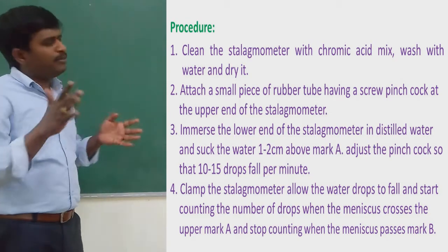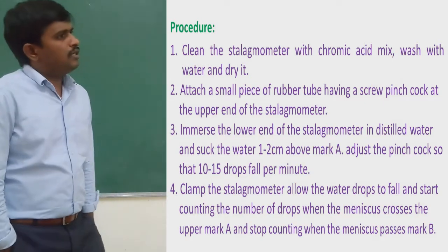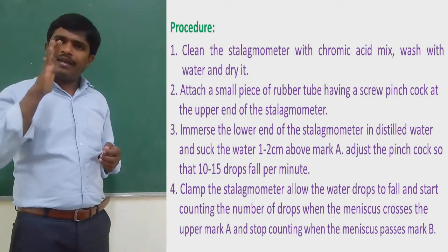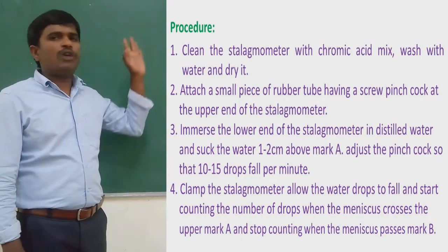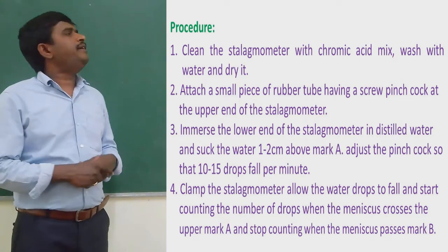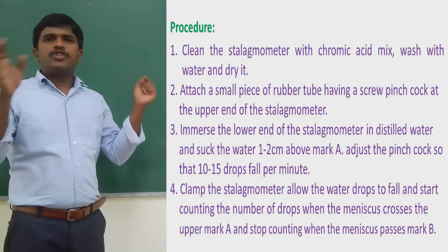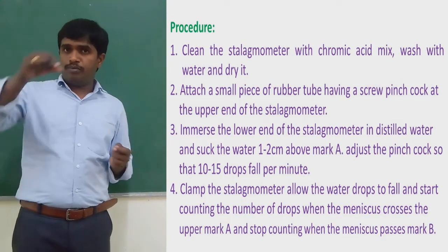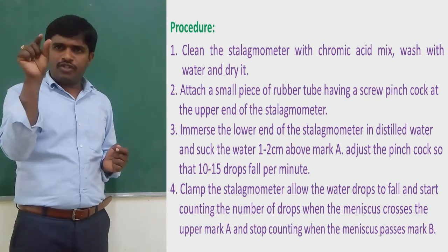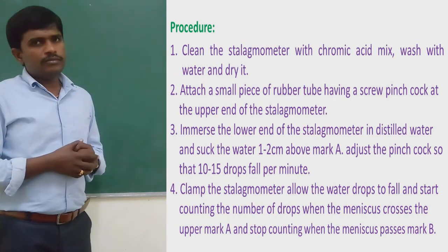Initially, before starting the experiment, we need to clean the stalagmometer. So the first point in this procedure is to clean the stalagmometer with chromic acid mixture, then wash with alcohol and water and dry it. Next, attach a small piece of rubber tube, which you have seen in the picture, having a screw pinch cock at the upper end of the stalagmometer.